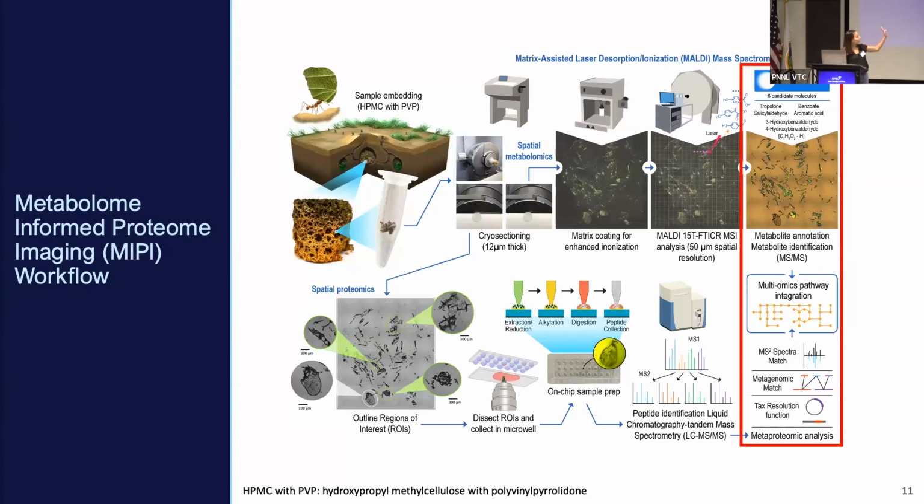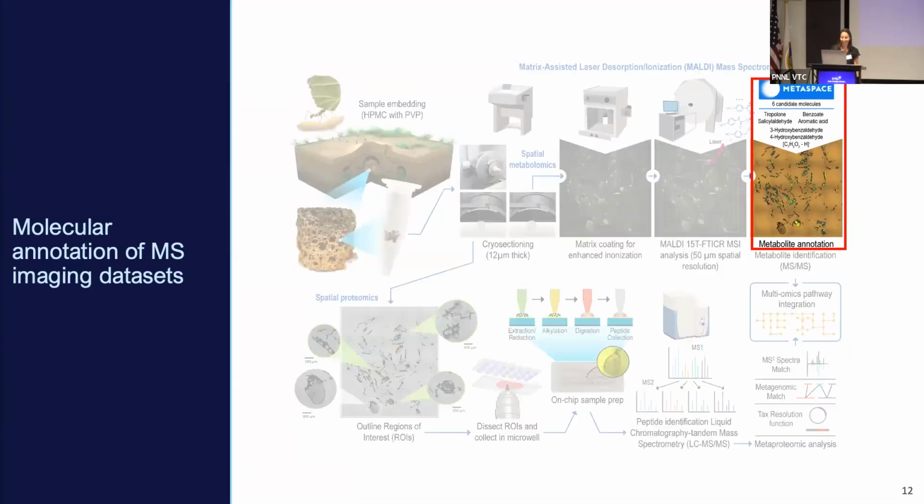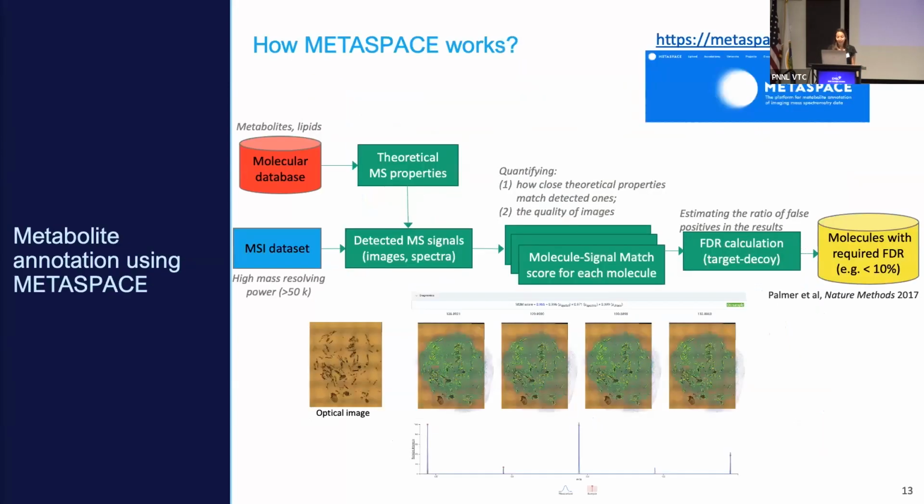Today I'm going to talk about the molecular annotation tool, then metaproteomics analysis and our integration, because this is more data science. For molecular annotation of mass spectrometry imaging data, we use Metaspace, an open source framework that is based on 3 principles. The first one is to compare our multi-mass spectrometry imaging data against the database and to do the annotation.